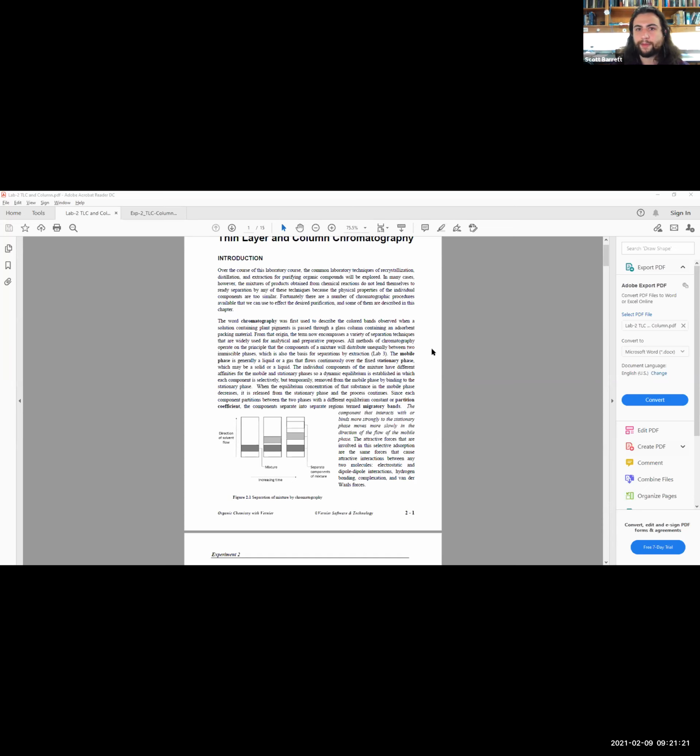I think I spoke about last time, ethyl acetate and hexane for recrystallization. Those are nice because hexane is just a long carbon chain. However, ethyl acetate has a carbonyl group as well as an adjacent ethoxide group attached to the acetate. And those 2 oxygens, as you know, will perform hydrogen bonding, leading to it being more polar than hexane, which is extremely nonpolar, only participating in those hydrogen-carbon interactions between each other. So, look through a good list of different types of solvents, and you'll learn which ones are more non-polar and polar.